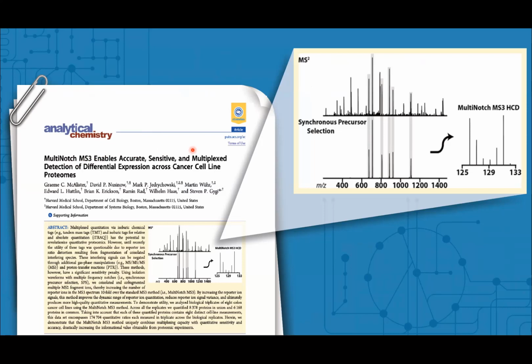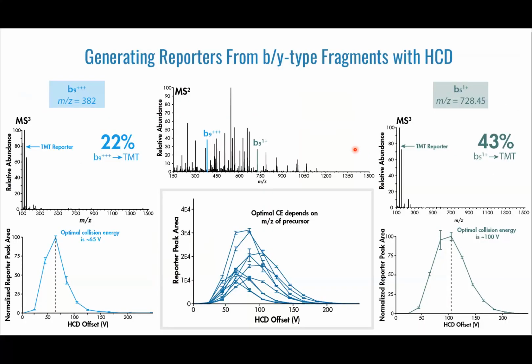So the idea is that when you TMT label a peptide, you have these reporter tags on the fragments, and if you want to get the best signal possible, you isolate these Y ions, and then you break them up and release the reporter ion from them, and that gives you the best quantitative signal that you can get for these reporters. But the price of that is that you reduce signal, because you're throwing away most of these things and you're only picking a handful of them. So your signal to noise on these reporter ions can be low.